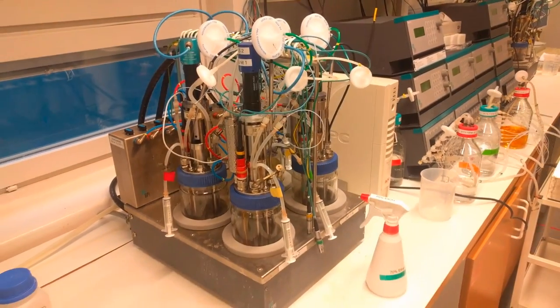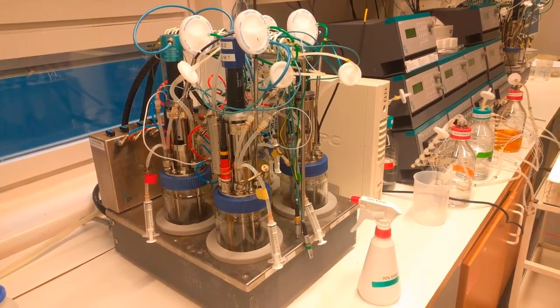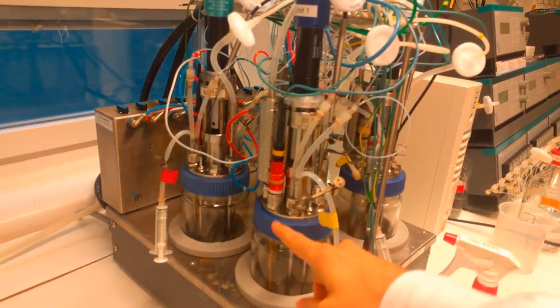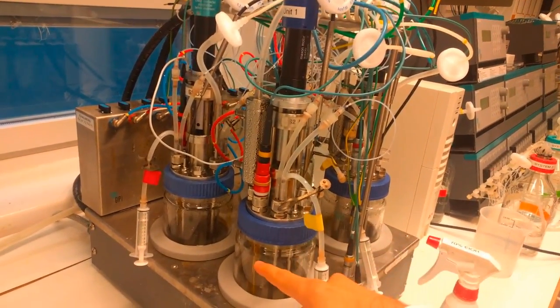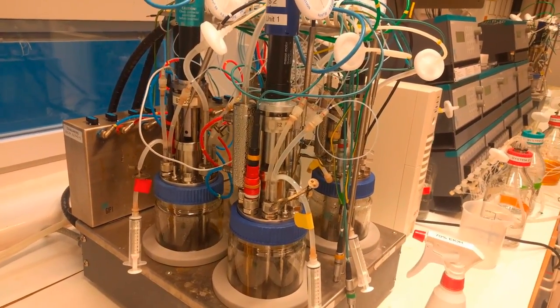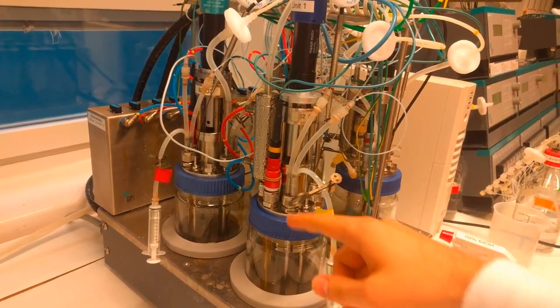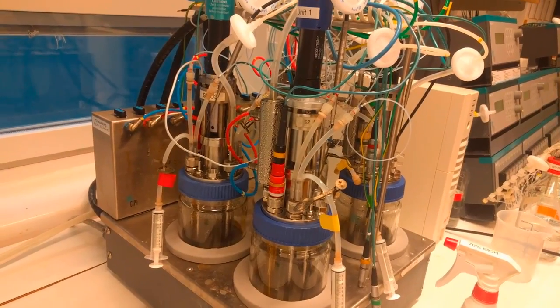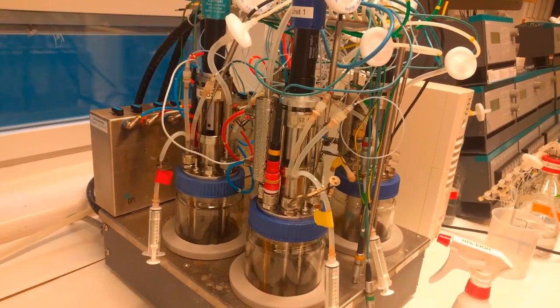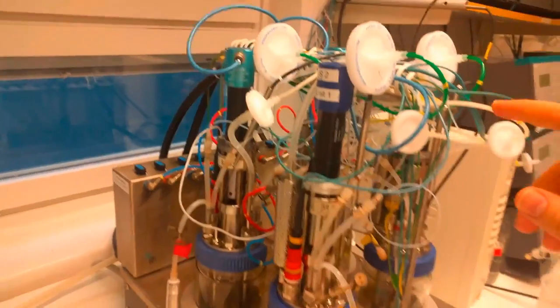All right, so as promised, we are now in the fermentation room and we're looking at a running lab scale fermentation. There are four fermenter vessels in front of you. First thing I want to point out is that pH probe we've been talking about that is sitting below the level of our media. You can see next to it, we have two tubes going in - one is acid, one is base. We're controlling the pH of this reaction using the probe and those two tubes and the pumps that we showed a moment ago.